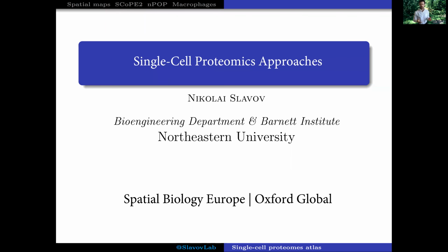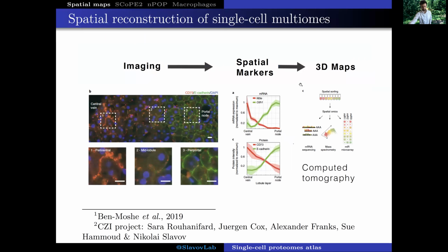Hello. Today I'm going to share with you some of the progress that my lab has made towards quantifying proteins in single cells and some of our ideas of how these data might be used for spatial proteomics. In particular, we are interested in combining the high spatial resolution of imaging methods, whether that's imaging messenger RNAs or proteins in tissues and with subcellular resolution, and the depth of profiling power of omics approaches.